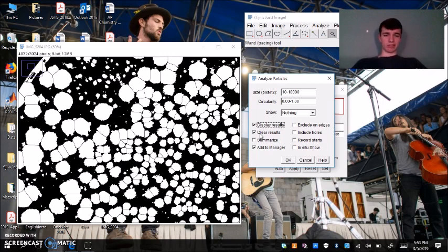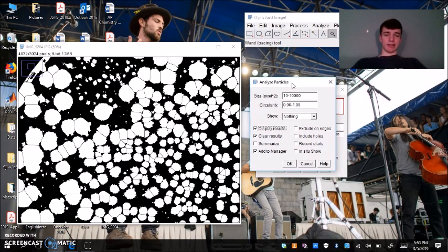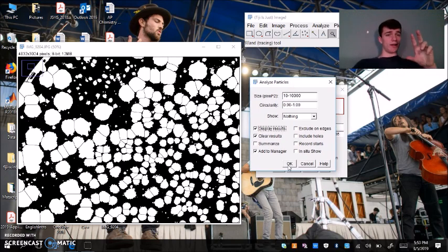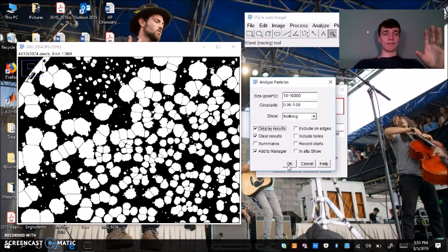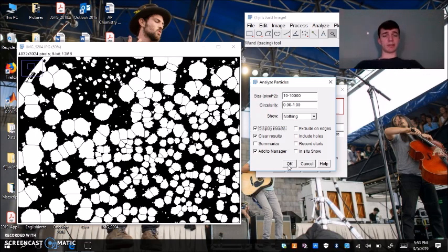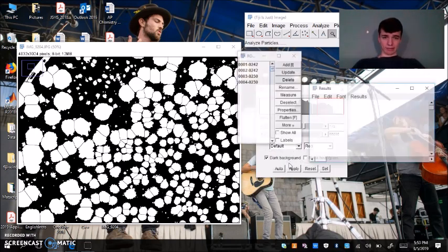What's really important about this step is that these three boxes are checked: display results, clear results, and add to manager. When we hit OK, two different pop-up menus are going to show up and that's going to give us the final number of how many colonies are in our image. So I'm going to go ahead and hit OK.